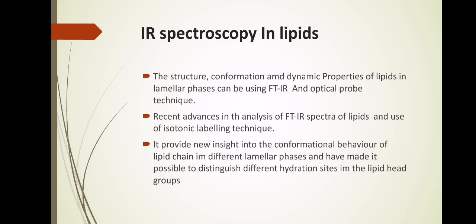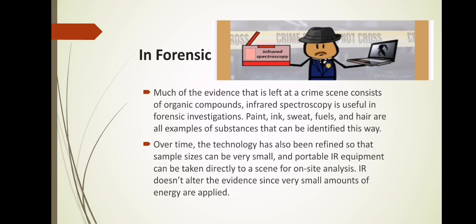These techniques have been extended to study lipid mixtures and to help determine whether microdomain formation is possible in liquid crystalline lamellar systems. FTIR studies gain information on membrane heterogeneity and have improved the understanding of membrane behavior.